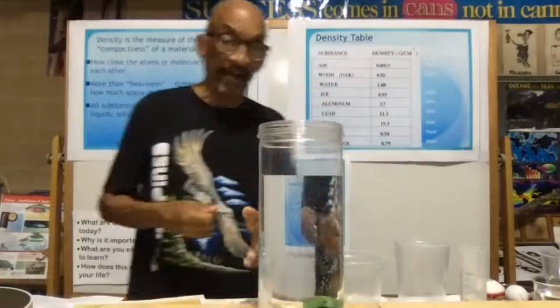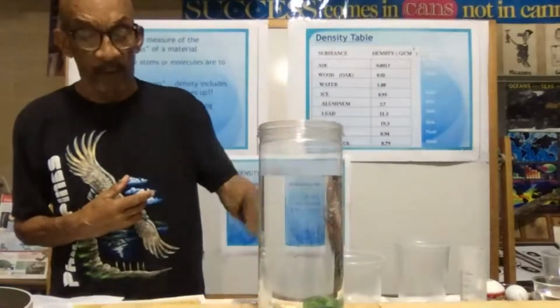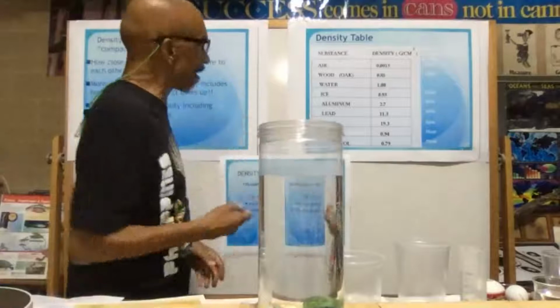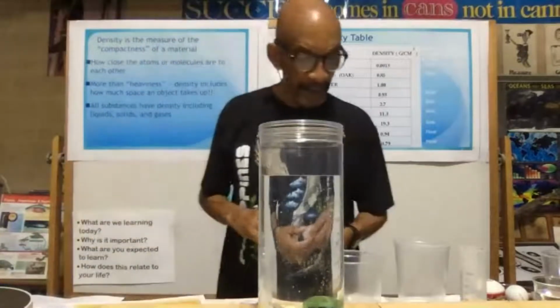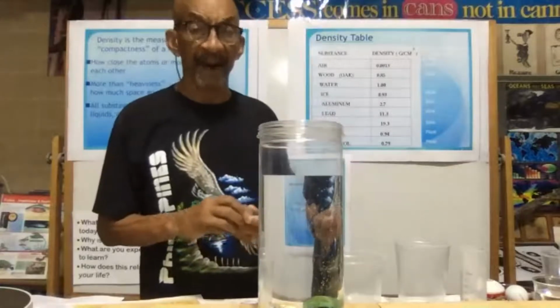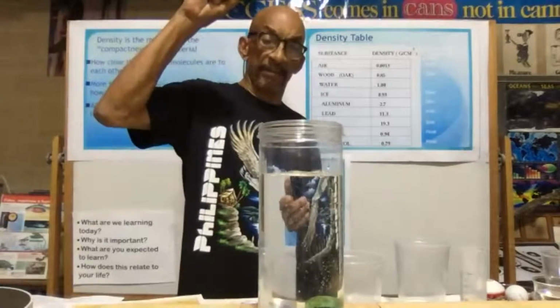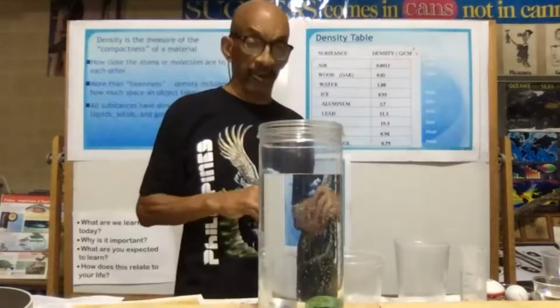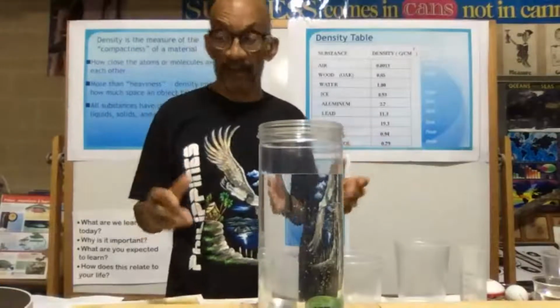So it has high density and water has a lower density. So guess what happened? The marble went down. I wonder what's going to happen with the cube. Let's see. The cube had a density of 2.9 grams per cm cubed, and it sunk also. Now, that's how you do those two, and there are other ways to measure density.